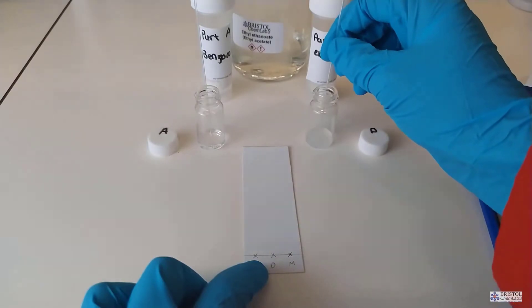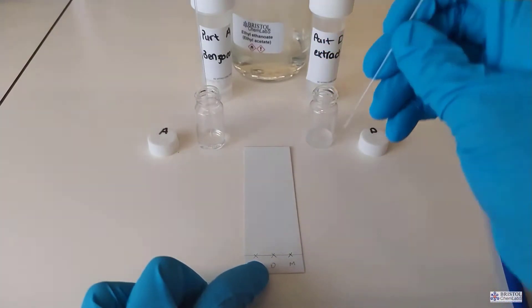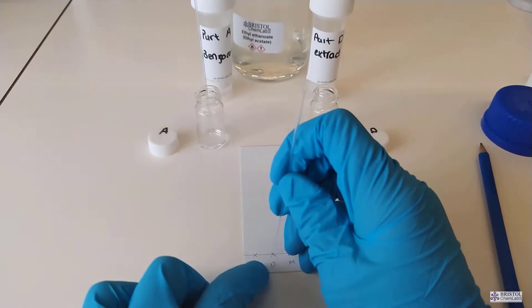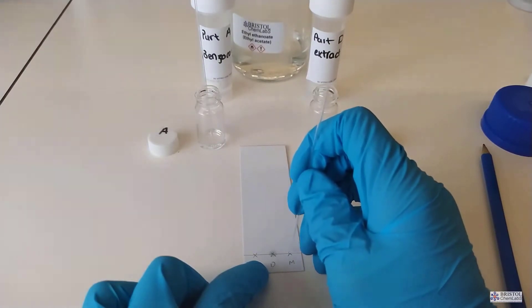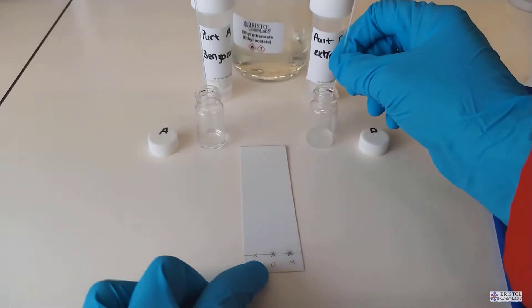Before we run the TLC we put the plate under an ultraviolet light. Because the sample applied has covered over the fluoresce it appears as a dark spot against a green fluorescing background. You can also check there are no impurities elsewhere on the plate at this point.